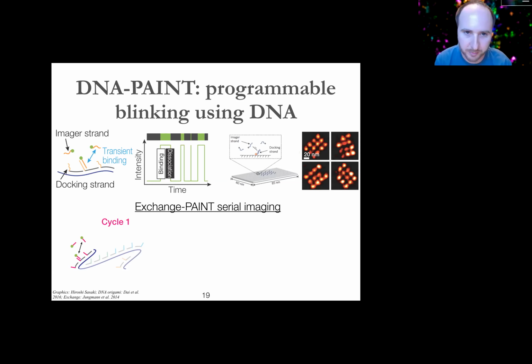So because the blinking is driven by sequence binding sequence, we potentially can design multiple orthogonal sequence pairs to use in multiplexed imaging. So the way that we can do this is, for instance, in this example, there are 4 different flavors of this docking strand, as we call it, that's going to target the paint imaging arrayed along, say, a stretch of chromosomal DNA. So the first one you're seeing here is the magenta sequence, and we can image that just as I described.